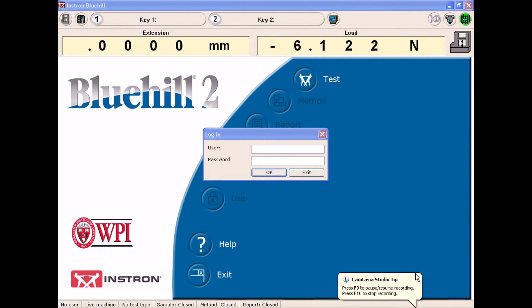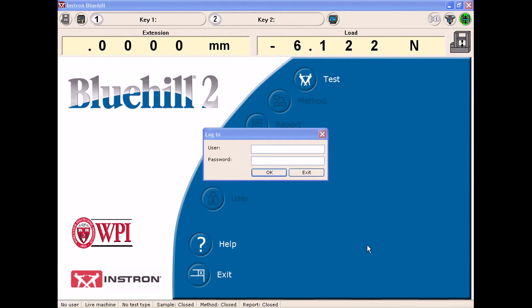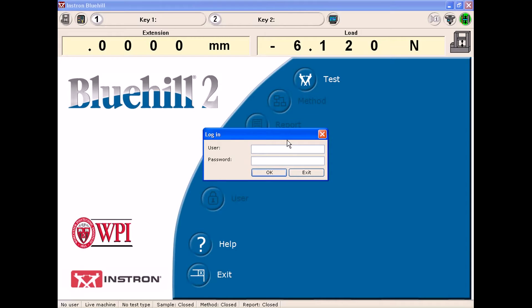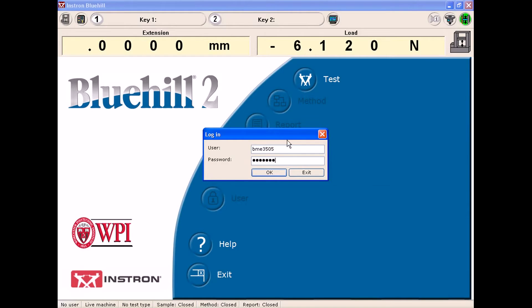This is the Instron page once I have launched the program from the desktop. What I'm going to do here is log in and I will use the BME class login to do so.